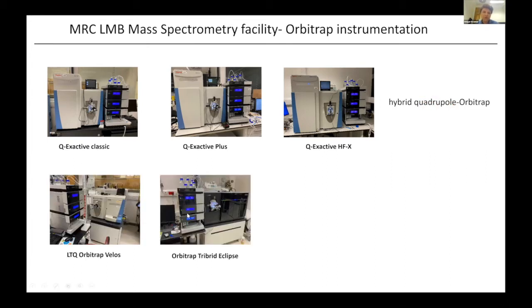Here's an example of 2 mass spectrometers that also contain Orbitraps, but in addition to the Orbitrap mass analyzer, they contain an ion trap as well. And again, that gives you more flexibility in terms of the type of experiments that can be performed with this type of instrument. It actually means you can optimize the instrument time, where different parts of the mass spectrometer can operate in parallel, doing different things as part of the instrument duty cycle.